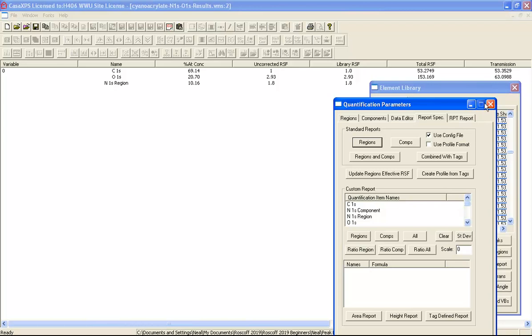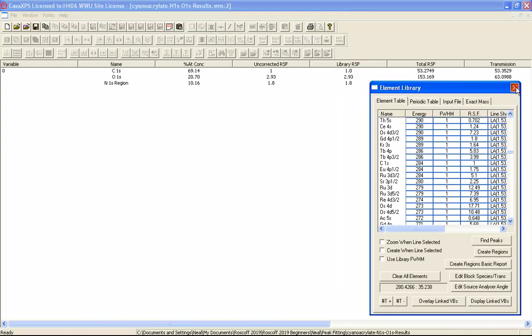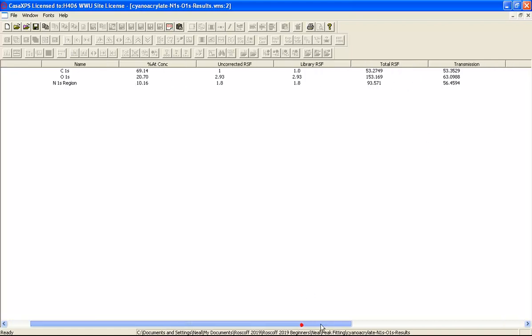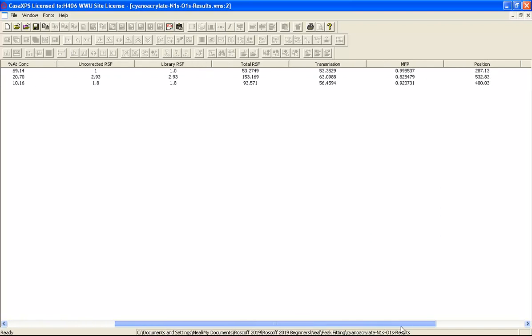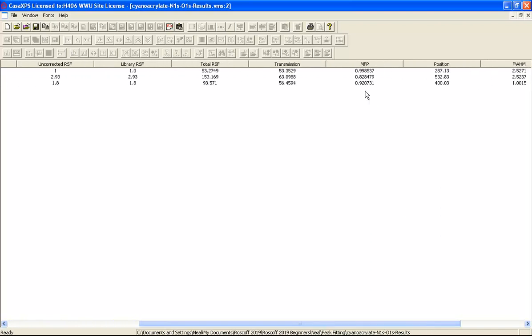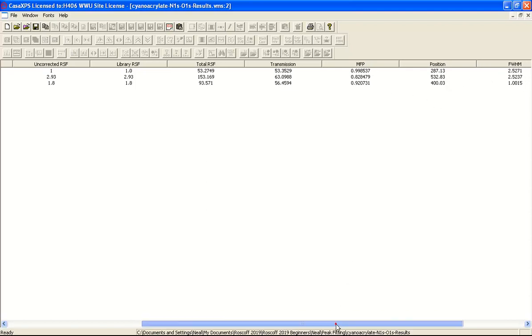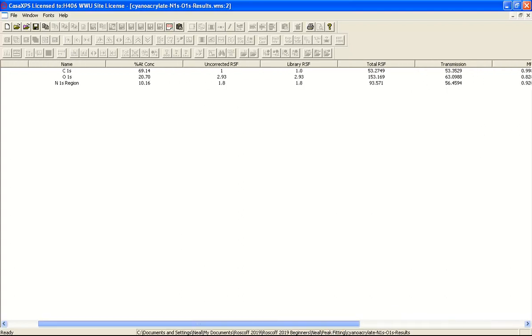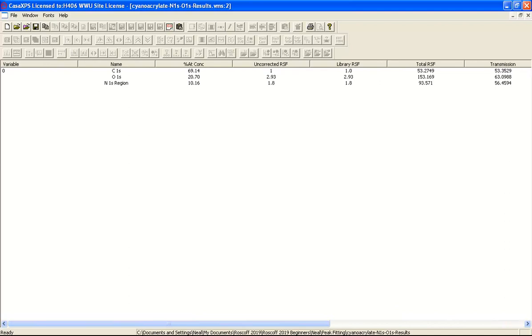Let me close these windows. There is also a total RSF that are applied to the areas that are calculating these atomic concentrations. The transmission function is reported in this report. I have also got effective attenuation for the mean free path correction. The escape depth correction. And then we get a bit more information over here in terms of position for its half maximum and the raw area. So this was a report that was created on the basis of a configuration file.